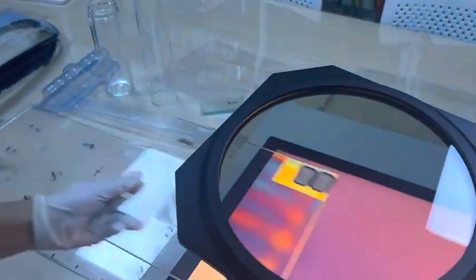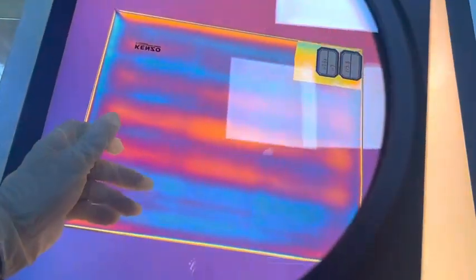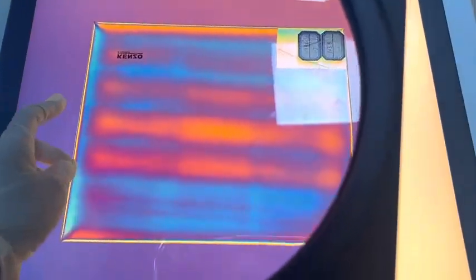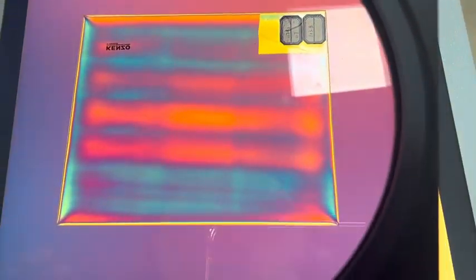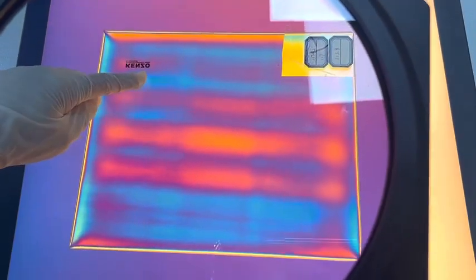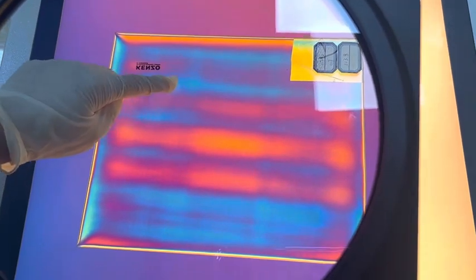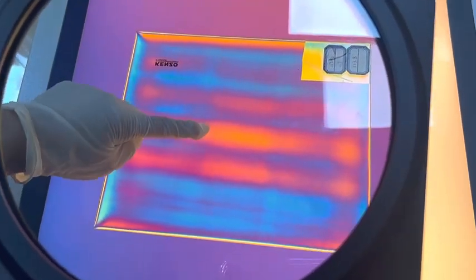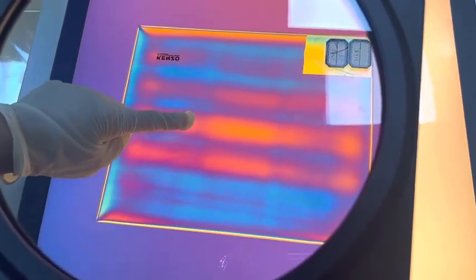Okay, let's see another sample. It's tempered glass for the solar energy industry. We can see blue stress patterns and orange stress patterns.